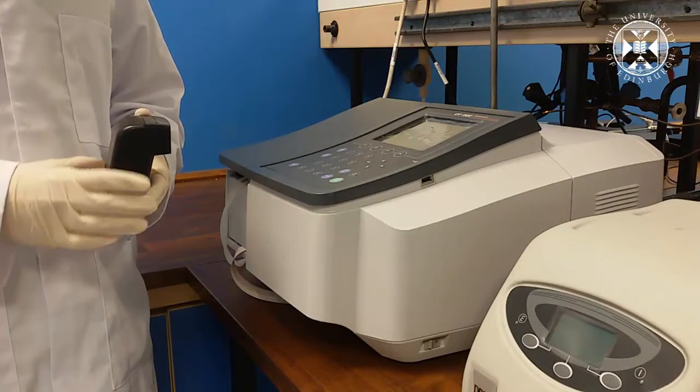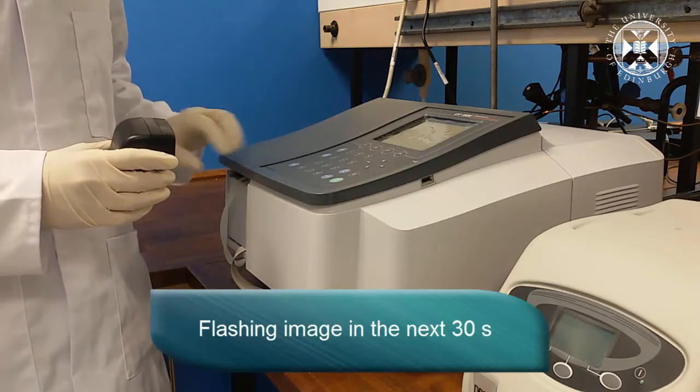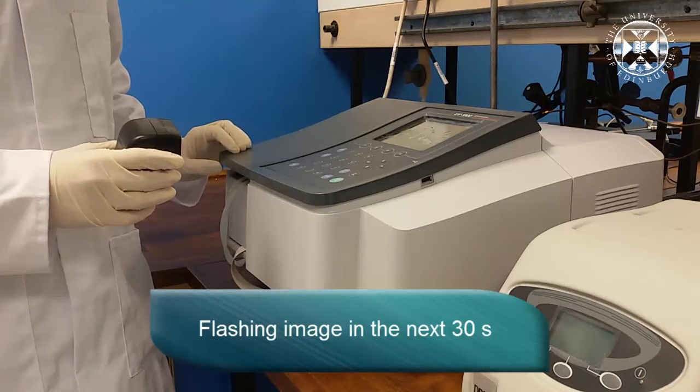When recording the spectrum in kinetics mode to determine the rate, we need to excite our sample from the trans-state to the cis-state. We do this using a camera flash like here.